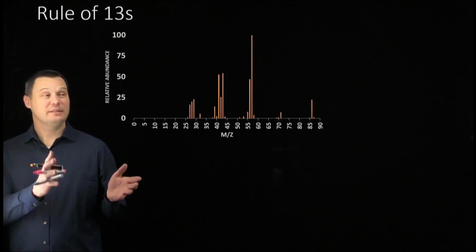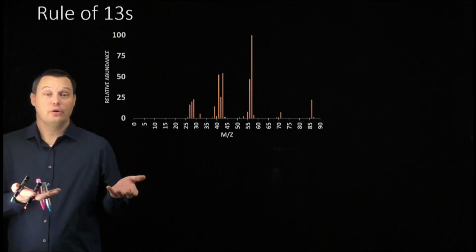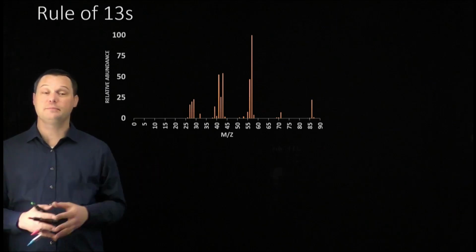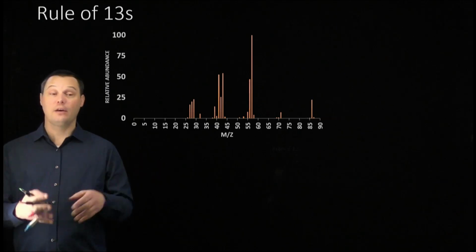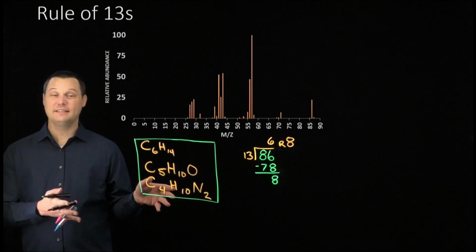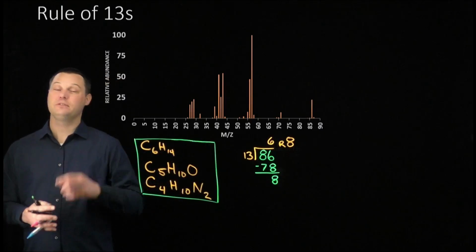Hey OChem Ninjas, here is a single mass spec, no IR, no NMR. Can you give me 3 plausible molecular formulas that would fit this spectrum without being provided with any other information? Stay tuned for the 13-second trick that's so brilliant it feels like cheating.